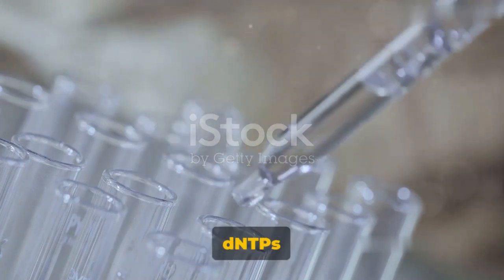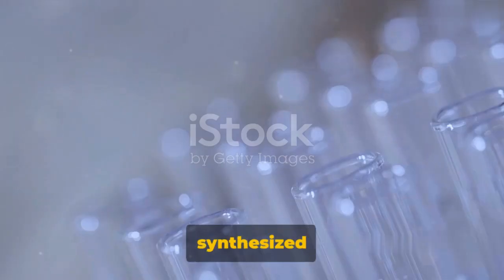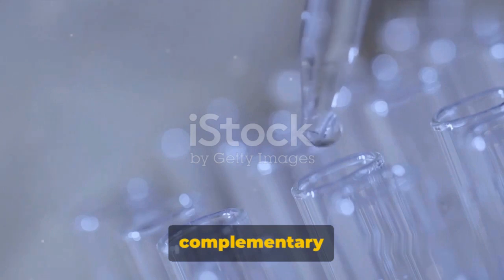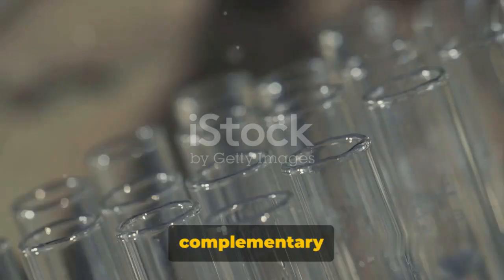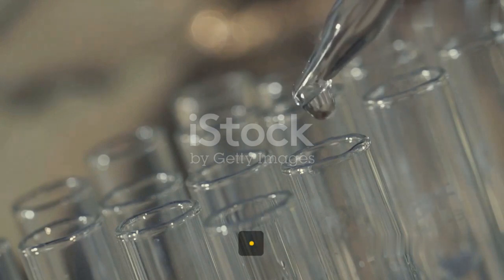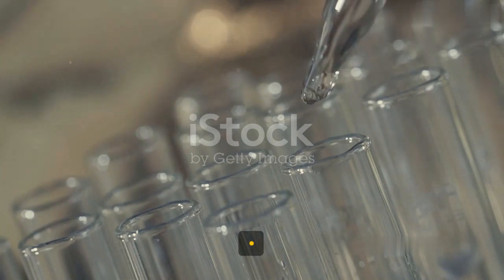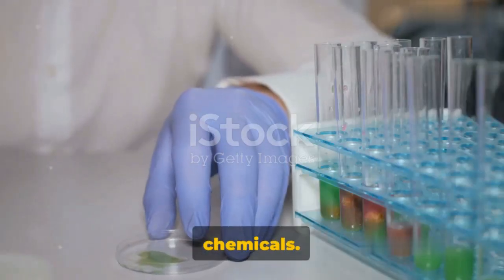Deoxynucleotide triphosphates, or dNTPs for short, are the building blocks of our genetic material. They are artificially synthesized nucleotides that play a crucial role in the RT-PCR process. Specifically, they are used for synthesizing complementary DNA, cDNA, and new cDNA strands during amplification. There are 4 different types of dNTPs used in this process: deoxyadenosine triphosphate, dATP, deoxyguanosine triphosphate, dGTP, deoxythymidine triphosphate, dTTP, and deoxycytidine triphosphate, dCTP.